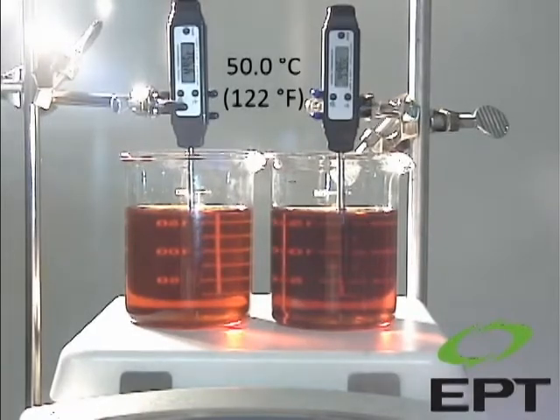The following demonstration is designed to emulate how lubricant varnish forms when a gas turbine shuts down and the lubricant cools.